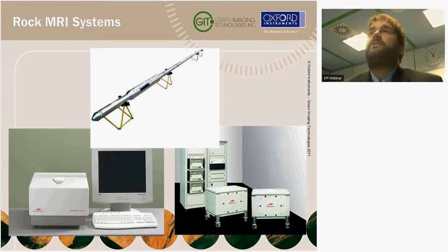For core analysis, the equipment is quite different. The diagram is a logging tool. It's probably quite an old logging tool at this point. This is an NMR logging tool which you drop down the hole and do a wireline log, doing some of these NMR measurements that I'll describe in a few minutes. The laboratory equipment is quite different. It's desktop based. These are some of the older models, but it's smaller equipment to measure 1.5-inch core plugs. You can have larger equipment to do whole core as well.